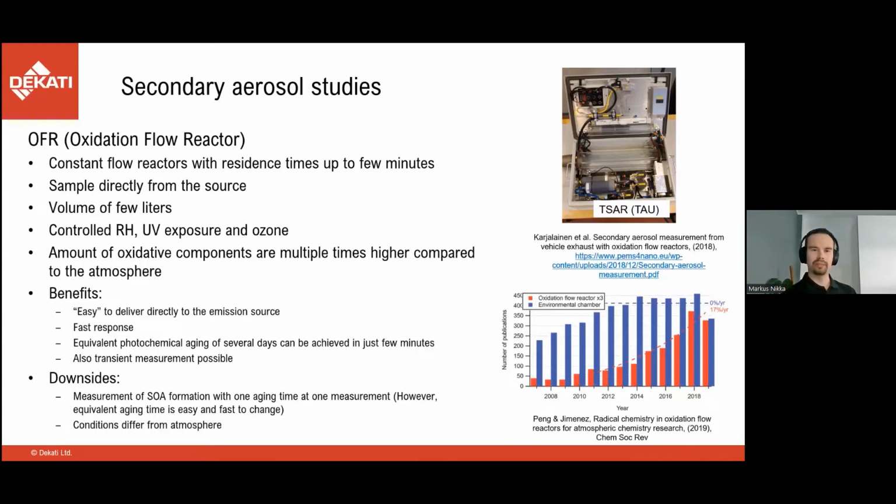So the benefits of these type of reactors are that they can be taken directly to the emission source, for example, the stack of a power plant. They have fast response times. You can get equivalent photochemical aging of several days in just few minutes.